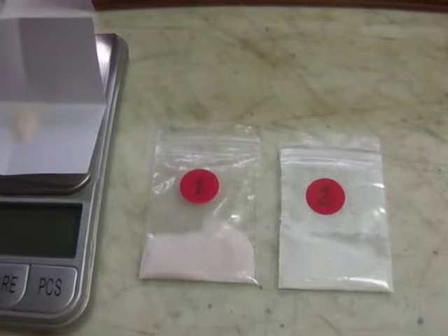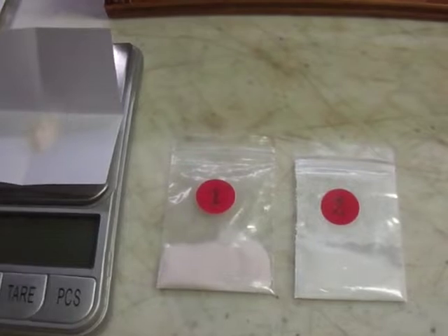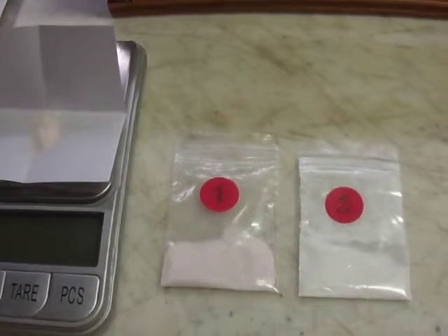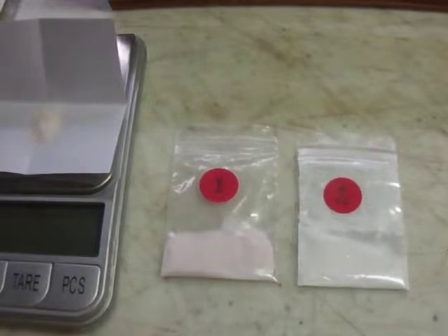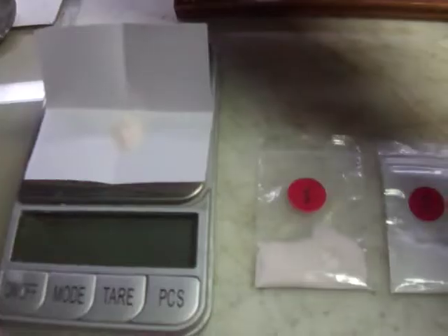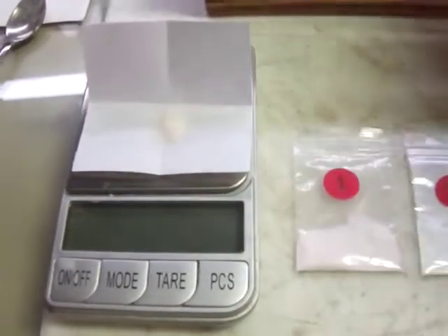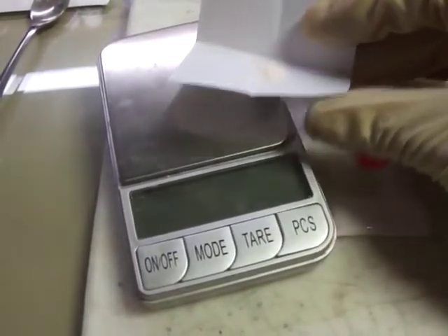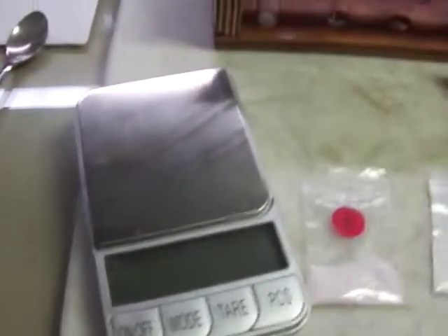There's generally 20 drops in a milliliter, so 2 drops out of 20 is about 1/10 of a milliliter, and if it was water, that would weigh 1/10 of a gram. And I'm assuming the solid's going to be about twice as dense, so that's going to be about 2/10 of a gram. And they say to dissolve 2 drops volume into 5 mils of water. So I'm going to use the 2/10 of a gram, which is consistent with the other references that I have too that use about 1/10 of a gram to 2/10 of a gram, or somewhere in that neighborhood. So that's 2/10 of a gram of the solid and 5 mils of water.